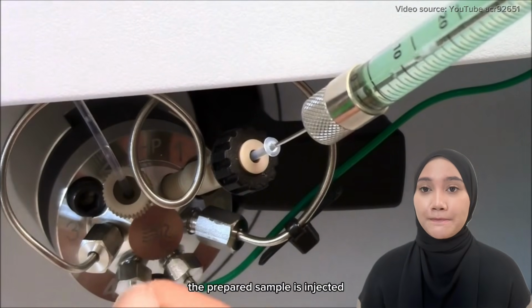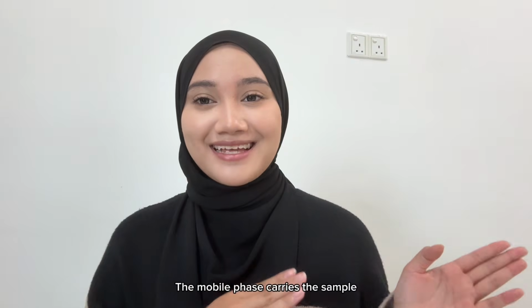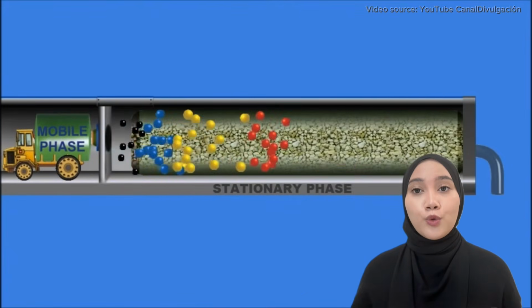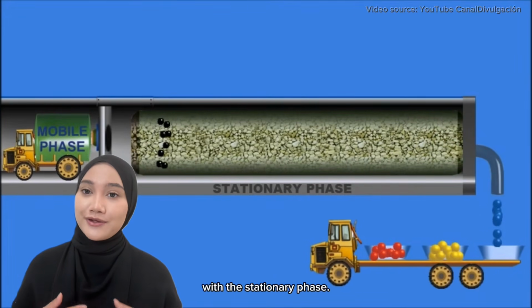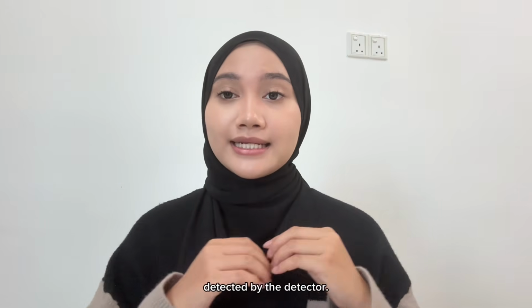Next, the prepared sample is injected into the HPLC system. The mobile phase carries the sample through the chromatographic column, where the sugars are separated based on their interaction with the stationary phase. Then the separated compounds are detected by the detector.